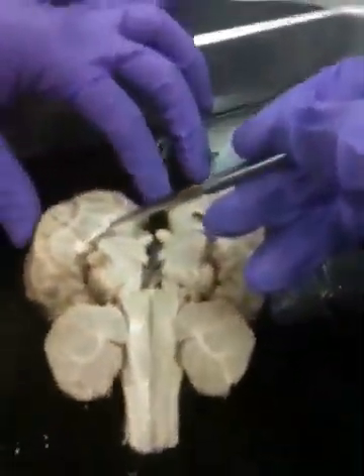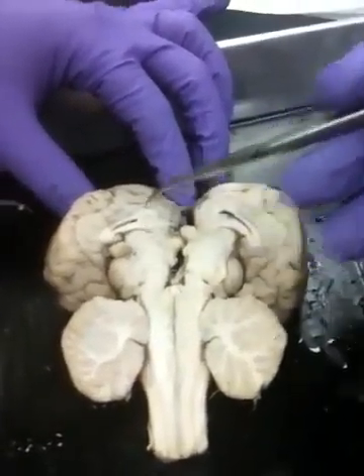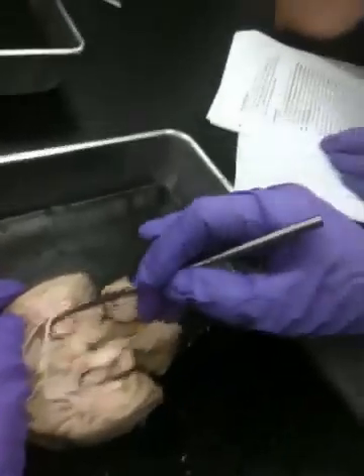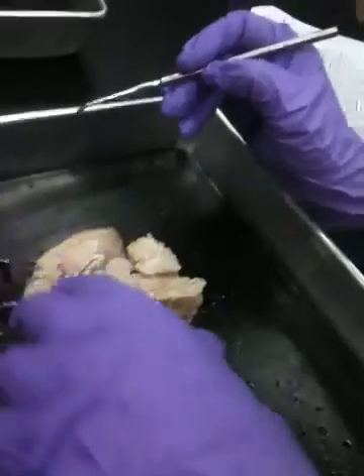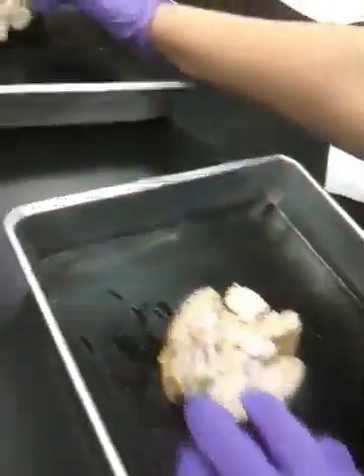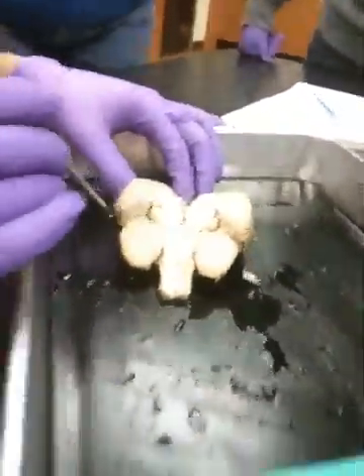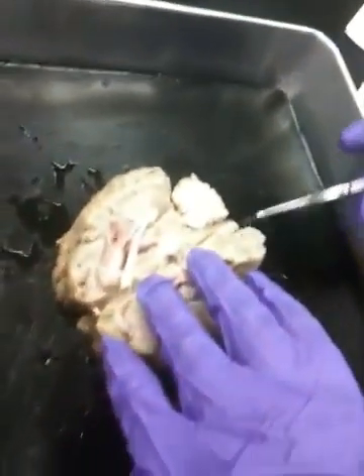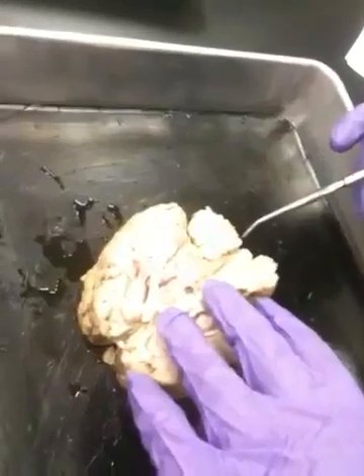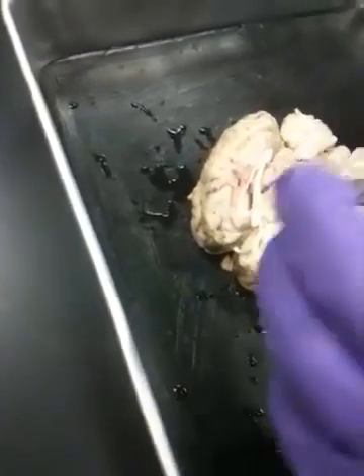You can see it in the model, it's right underneath all of that. Yeah, right underneath. So we got lateral, and then we got third. And you can still see it here. We can create that space with our pointer, but it's not as clear as on that one. Fourth ventricle is the hardest. It's this space in here. Okay, that's fourth ventricle. This is one of those times when the model is better for the fourth ventricle. The fourth ventricle looks like a little star in the model, at the very bottom. And we just don't have enough of the external structure to see more of that.